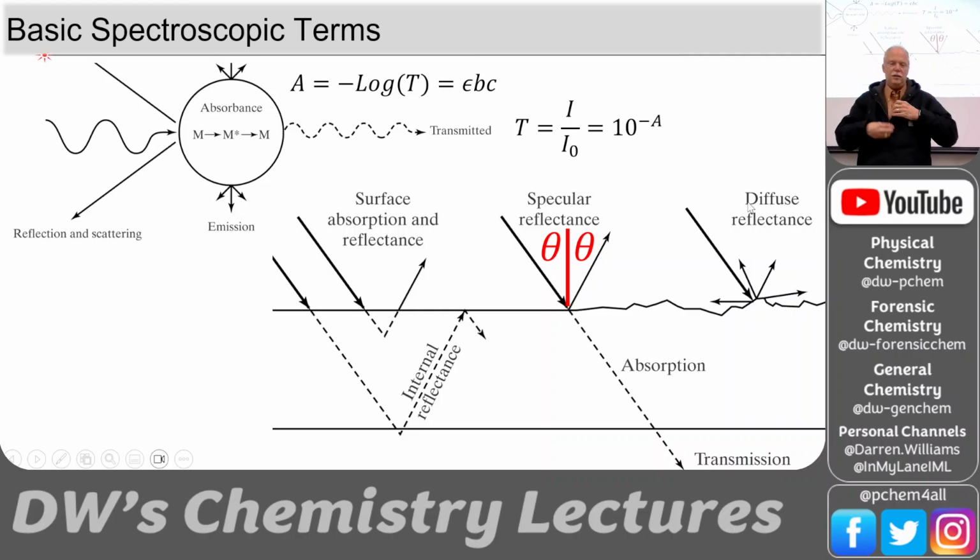So let's look at some of the basic spectroscopic terms. Starting to warm up. Arms are thawed.